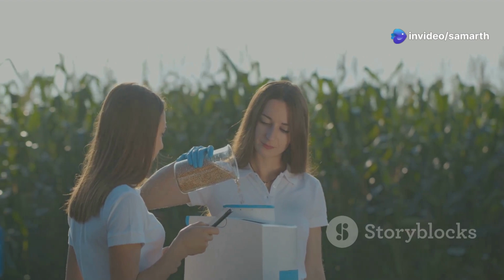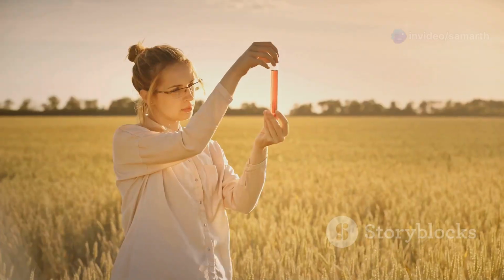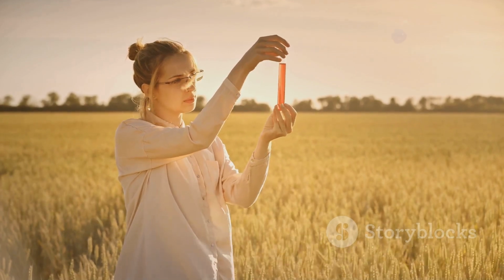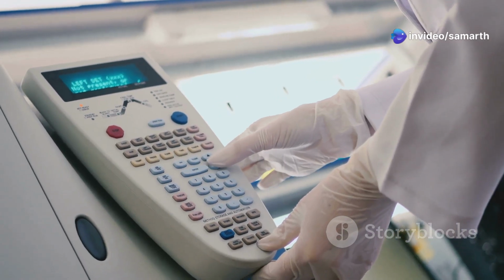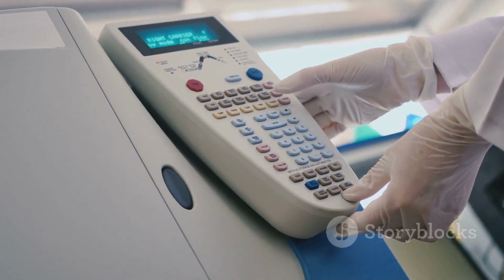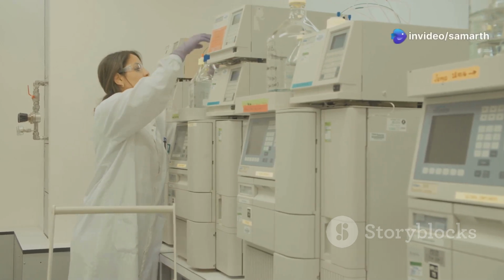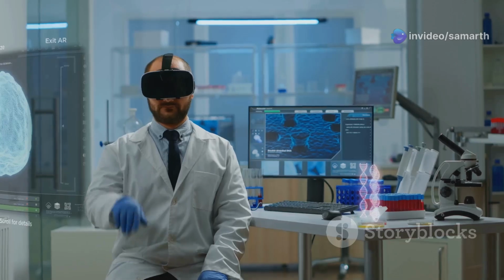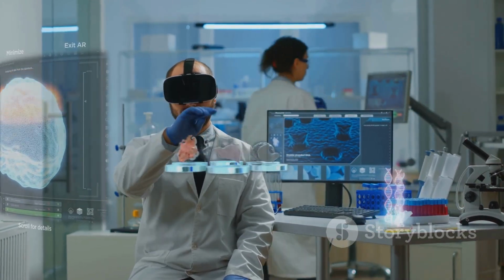4. In food science and agriculture, FTIR spectroscopy helps ensure food safety and quality by detecting adulterants, identifying the origin of food products, and analyzing the composition of crops and soil. FTIR spectroscopy has revolutionized scientific research and industrial processes by providing a rapid, non-destructive, and highly accurate method for material analysis. Its versatility and wide range of applications have made it an essential tool in advancing our understanding of chemistry, biology, materials science, and many other fields. As technology continues to evolve, FTIR spectroscopy is poised to play an even more significant role in shaping our world.